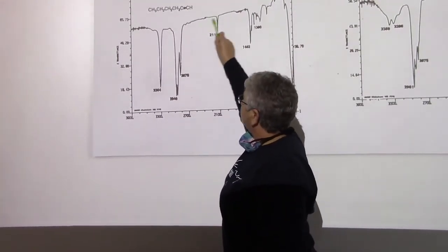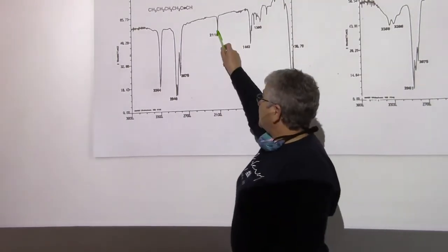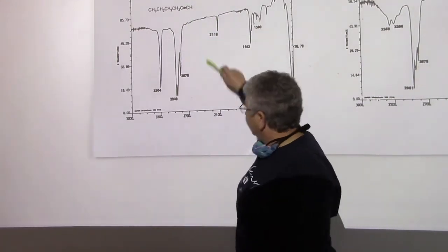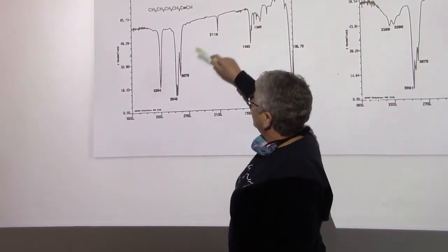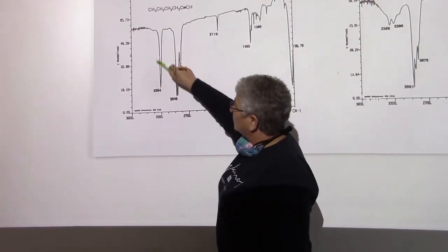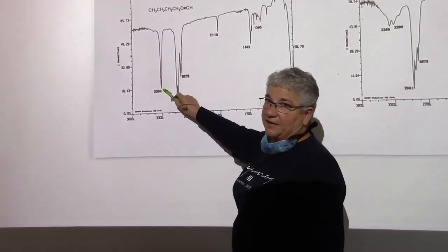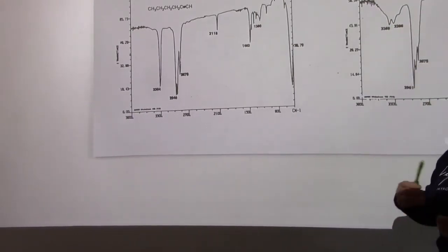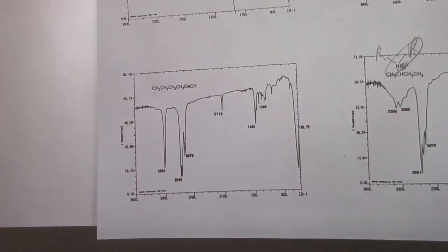Right? So remember, this region of your spectrum, triple bonds. And so you see peaks. The triple bond peak is always a small peak. It's never a deep peak. And so you have that identified as a triple bond. CH stretches here, fingerprint here, but the dead giveaway is right here, right? And if you look at the shape of this peak versus the shape of the NH peak versus the shape of the OH peak, you can see that they are in fact very different from each other.